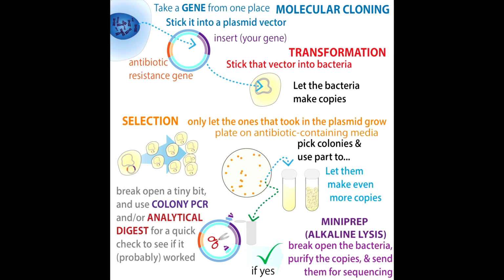Agar is a sugar that we can use to make a gel, and we make it usually from LB, lysogeny broth, which is like bacteria food. We have the LB and we spike it with the antibiotic. We do that while the gel is liquidy, and then we pour it into the plate and it hardens, and we have this gel that the bacteria can grow on.